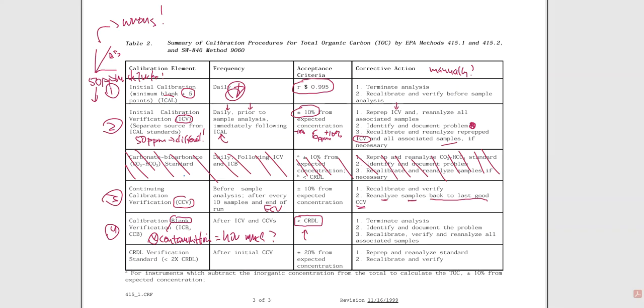And what I'm hoping to demonstrate is that the calibration blank that we are running, this verification that's treated as a sample, is going in and we're solving for how much is in the blanks that we are using, those solvents that we're using, aka water. And we hope that there's hardly anything at all. We don't want that blank to contribute anything to all of our calibration curves, all of our standards that we have made with it, and so on.